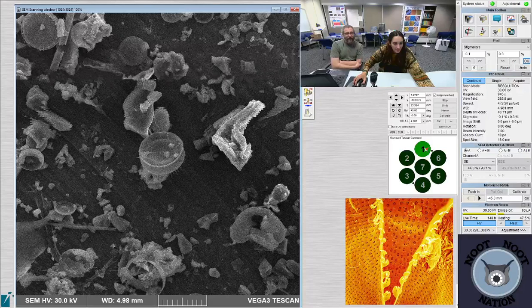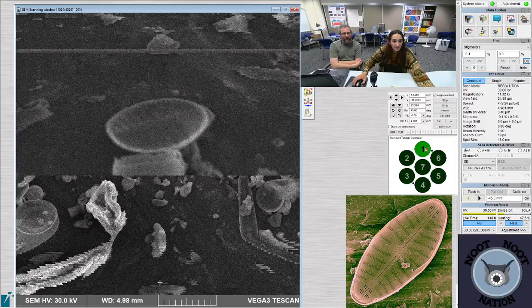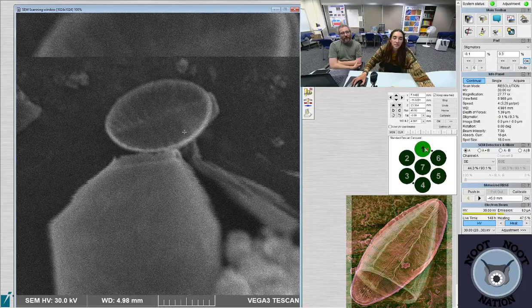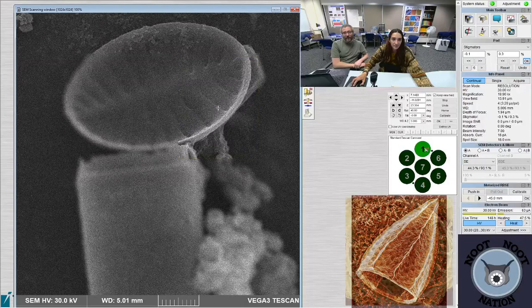So, we're just training Laura on how to use the SEM, and also I'm helping her learn to identify diatoms that she's likely to come across when she analyzes the Gull Lake samples, because the two lakes are right next to each other. So our assumption is that they probably have similar flora between them, but there's no guarantee that that's always going to be the case.